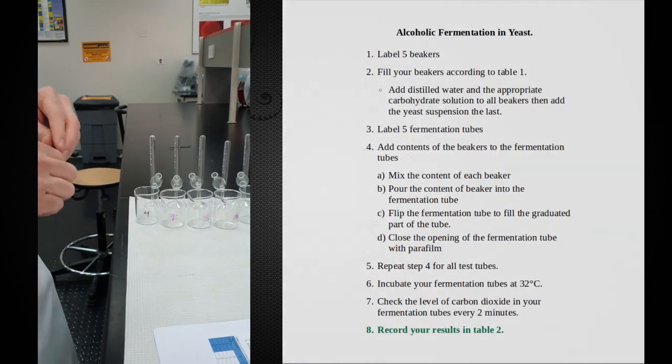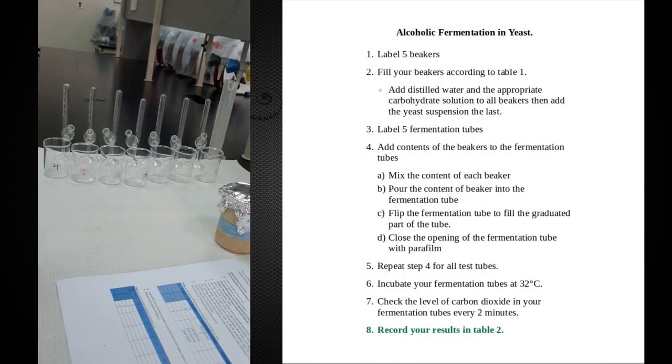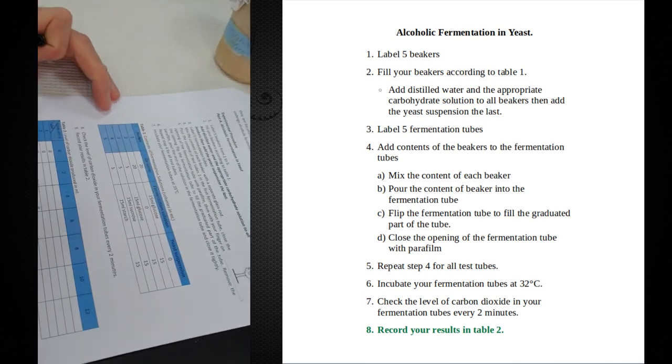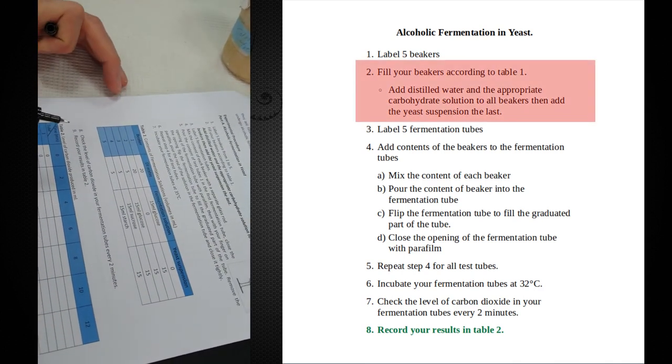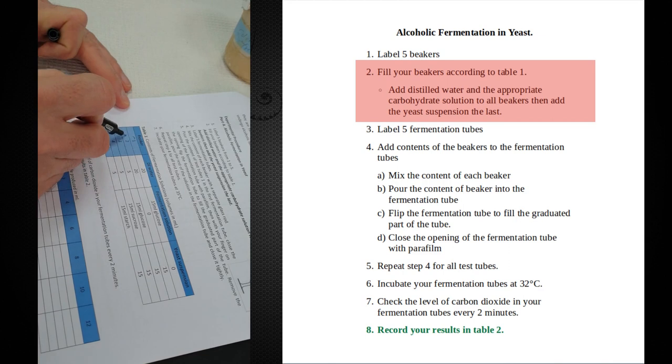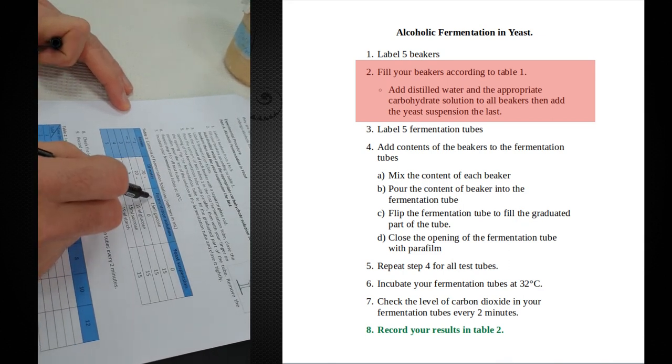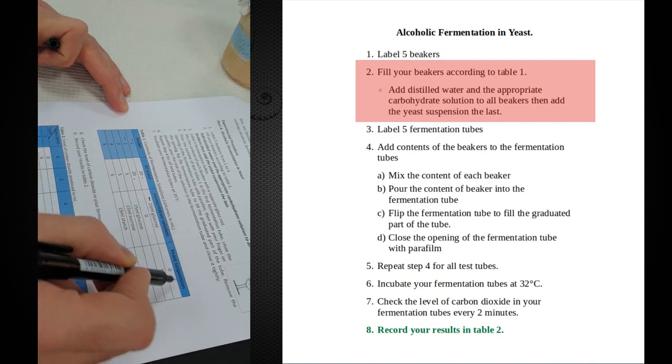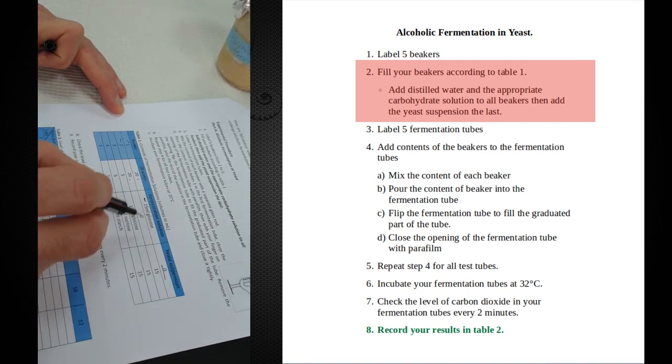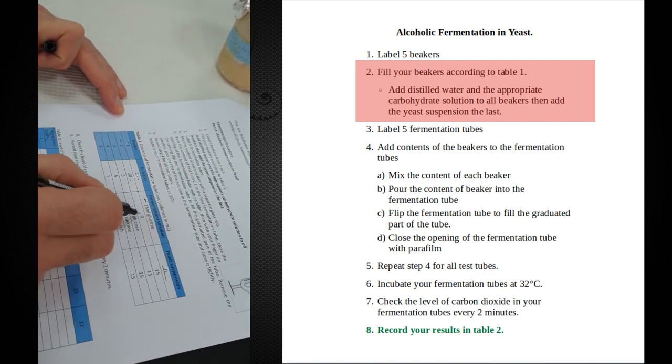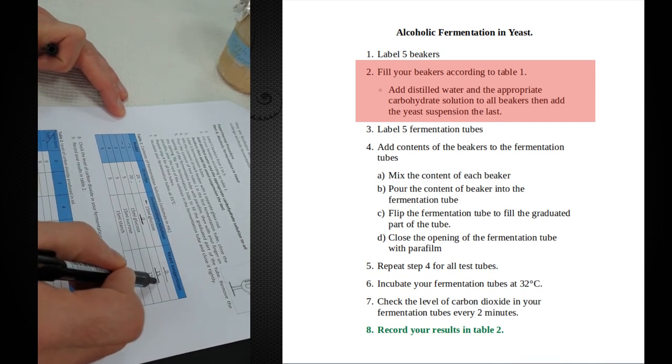First things first, we're going to set up some negative controls. When you look at our beakers, beaker 1 and beaker 2 both get water. Beaker 1 gets fermentation solution, 50 ml of glucose, but no yeast. Whereas beaker 2 gets no fermentation solution, it only gets yeast.